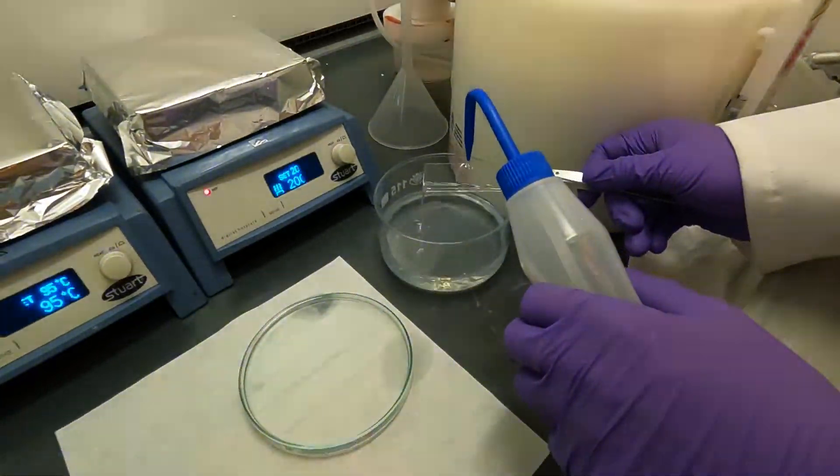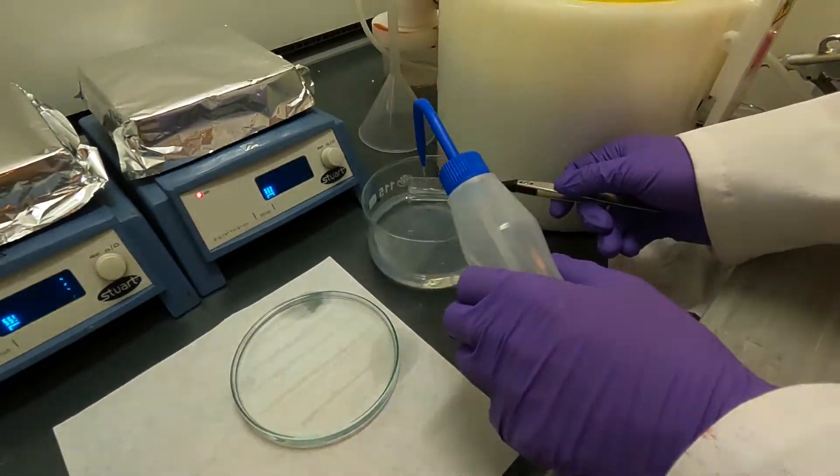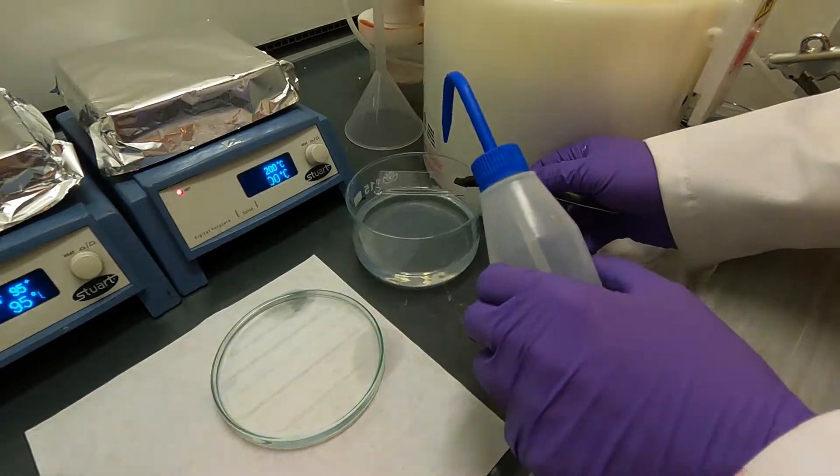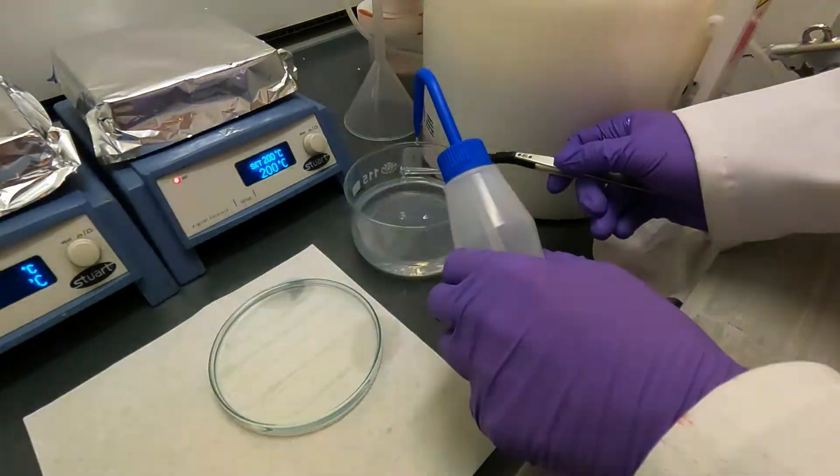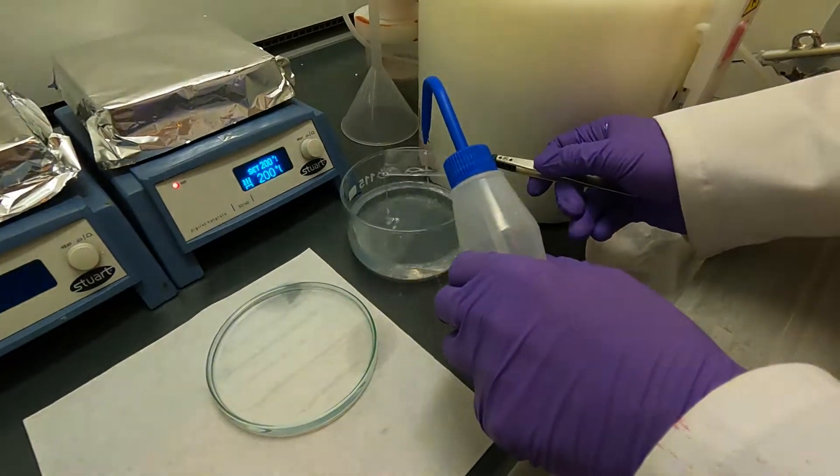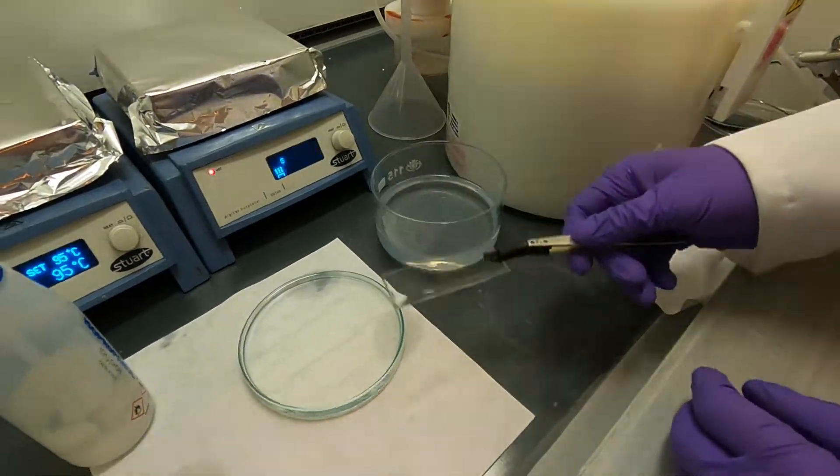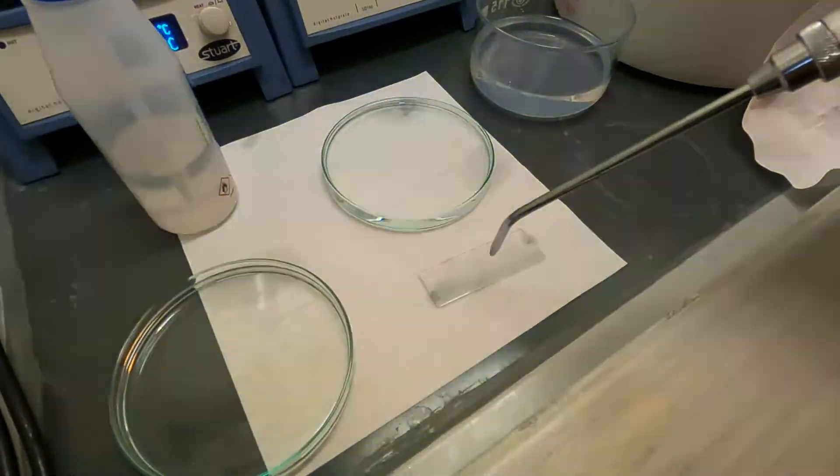The structure should be robust at this point because the SU-8 has quite strong adhesion. I usually tend to avoid squirting isopropanol directly at the structures. Rather, I let it trickle down over the structures by sending the isopropanol near the edge. I'm going to put it now on the piece of paper and blow it dry.